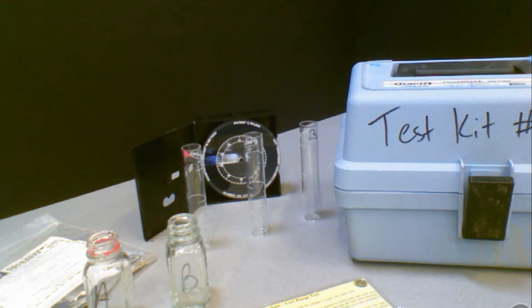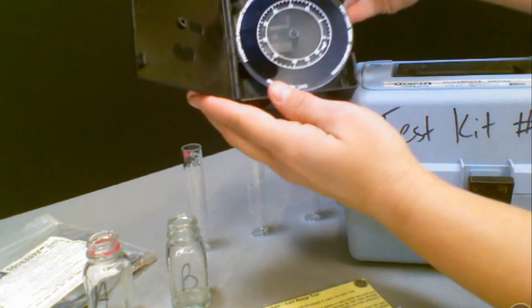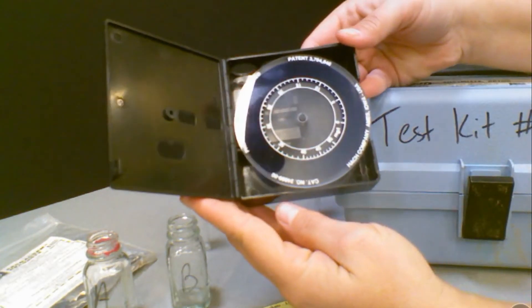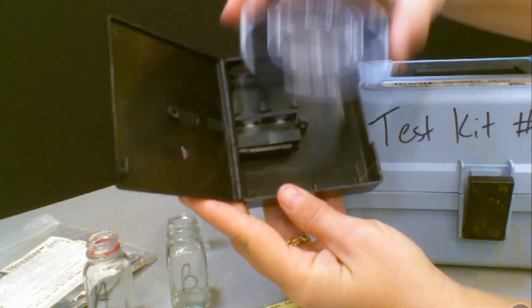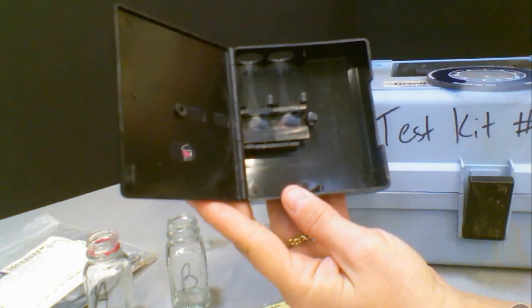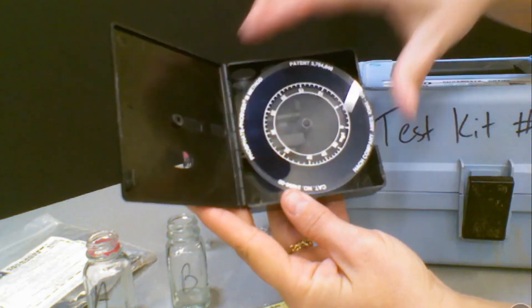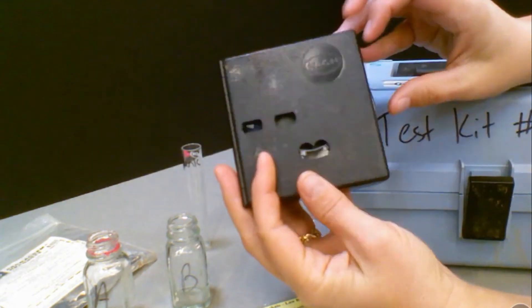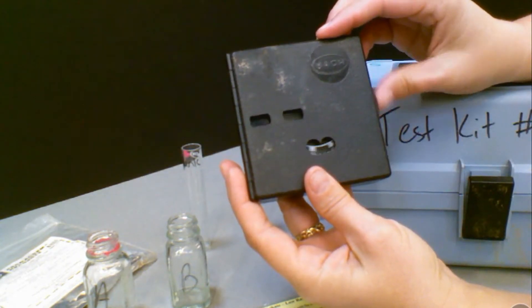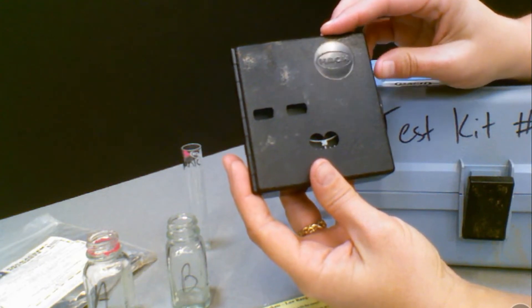Aside from the chemicals in the Ziploc bag, we also have a device called a color comparator. It's important to take a look at these closely because you'll notice inside of this color comparator there's a mirror. When you're using this, you need light to shine down into the color comparator to go through each of the test tubes so that you can get the proper color match for this specific test. This is different than the other color comparators that come with other tests you might do.